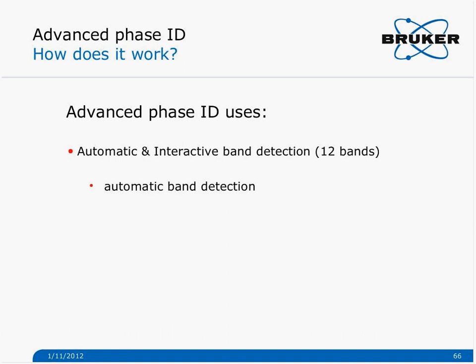So you have, like Daniel presented earlier, the automatic band detection, smart band detection, or manual band detection for a full call. And it has a fast indexing. It uses a fast indexing algorithm, so you can find the solution fit. For instance, in between thousands of solutions, it will take less than a minute, and the results will be sorted based on the indexing quality.